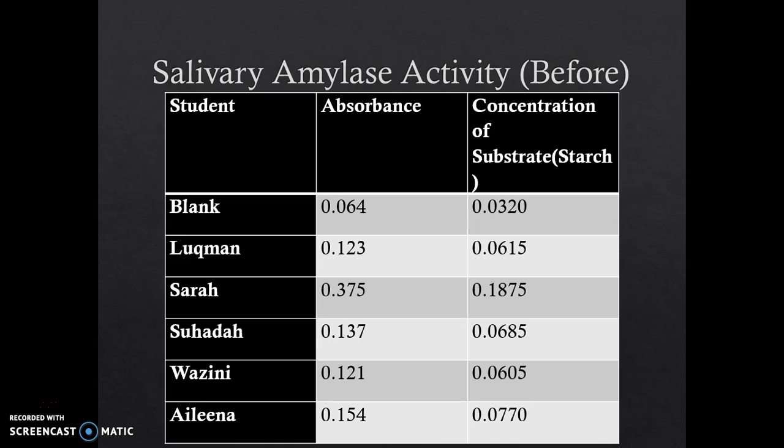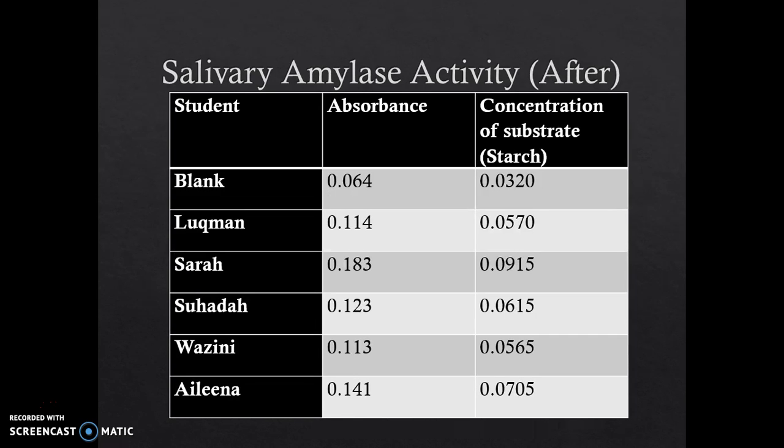This is the result before the stress activity. This is the result after the stress activity. The concentration of substrate we get from the standard reference graph.